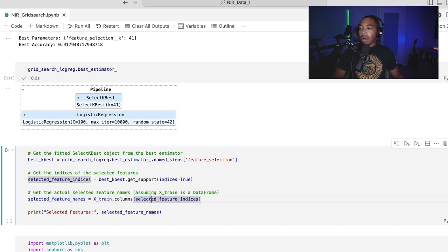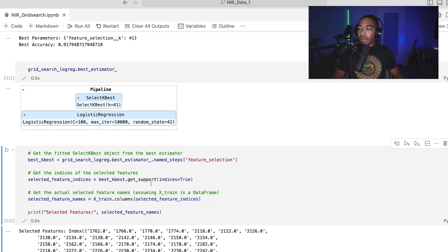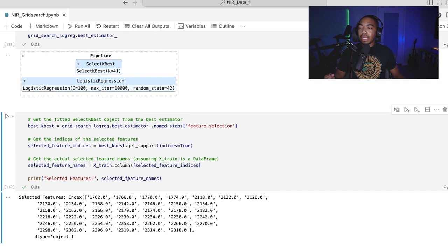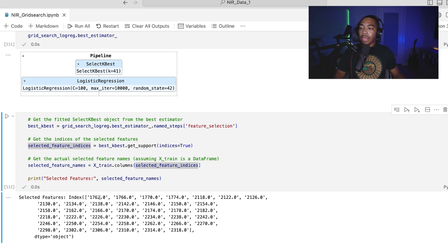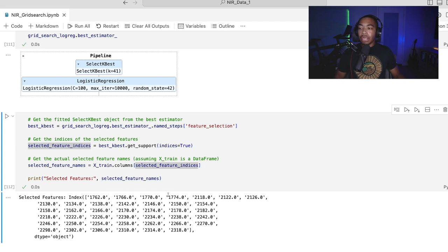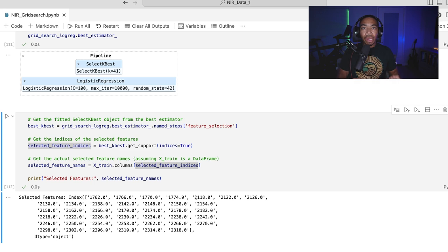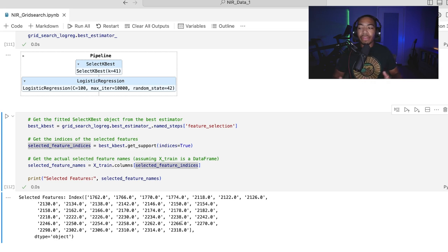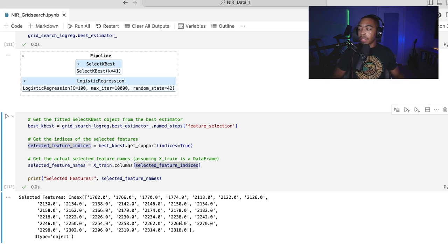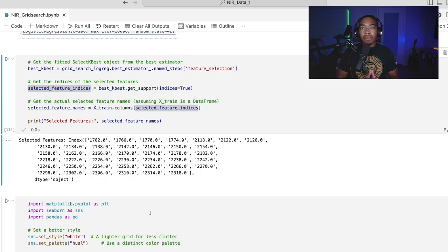When I run that, you can see that these are various wavelengths, a few at the beginning of our spectrum, and many more towards the end of the spectrum, 2100 and beyond, that seem to bear the most amount of information about the various classes of plastics.